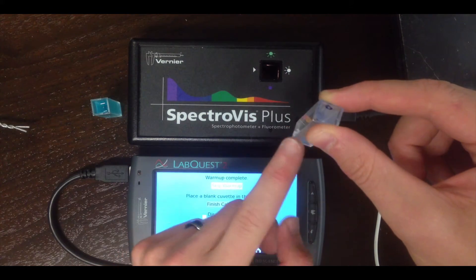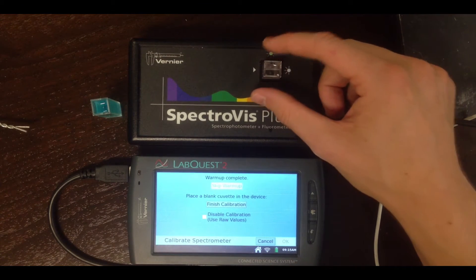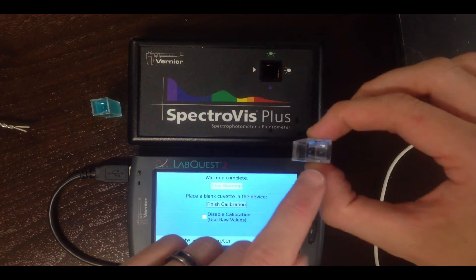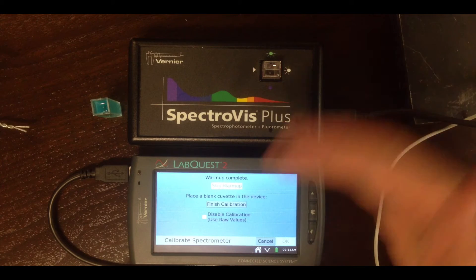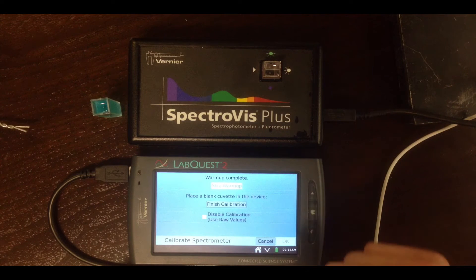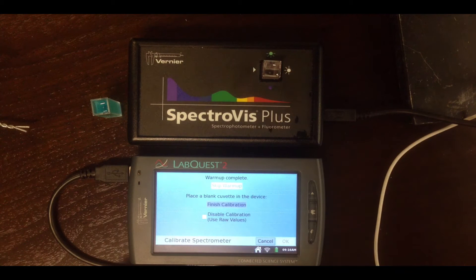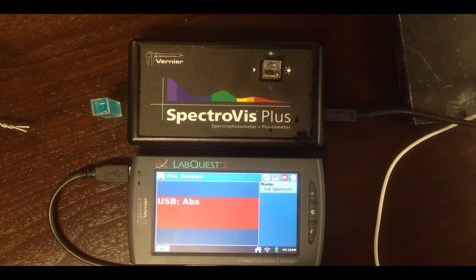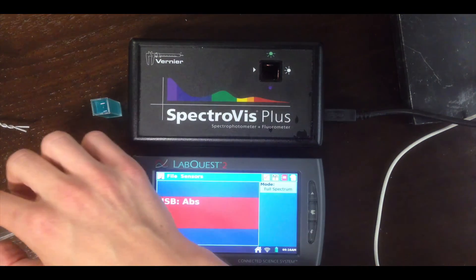The light source is going this way, so place the cuvette so that the completely transparent side is within the path of the light beam. If you don't do this, you'll get wonky spectra because the grooved side scatters the light. You also want to make sure the liquid level is above the top of the light beam — otherwise the liquid surface will scatter the light and mess up your spectra. Once it's in and pointing the right direction, hit Finish Calibration. The LabQuest stores the spectrum of water and will subtract it automatically from any future spectra.